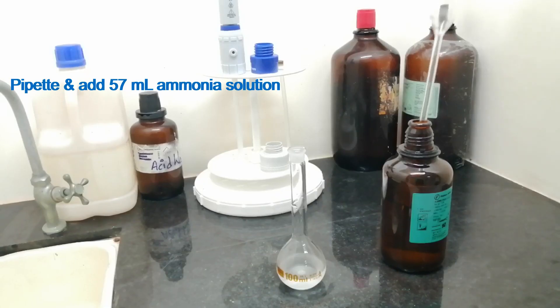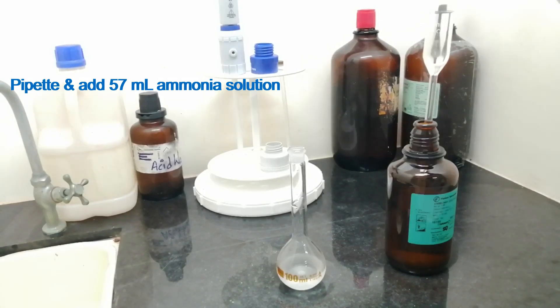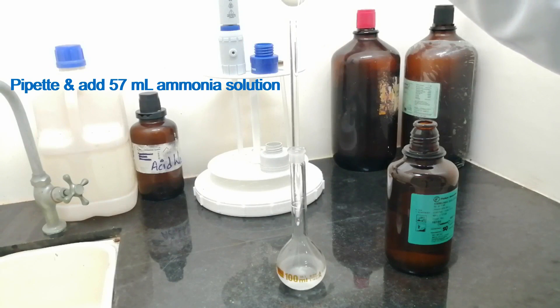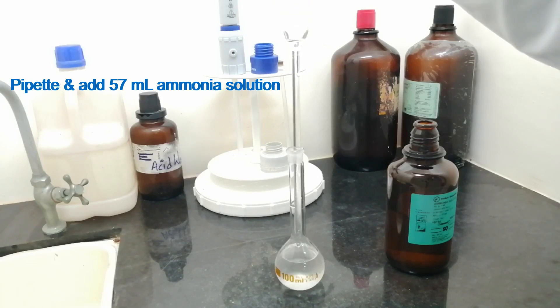Add 57 ml of ammonia solution to the flask.